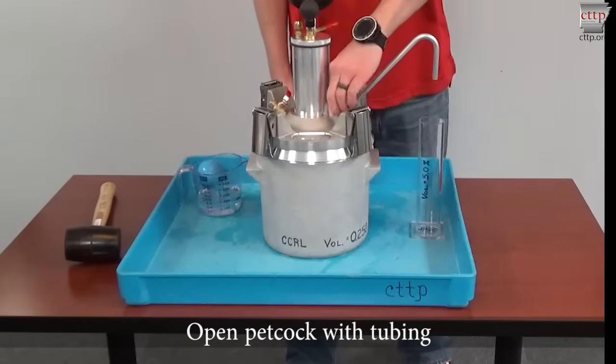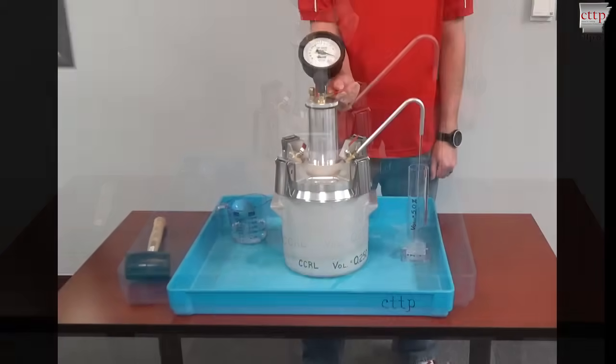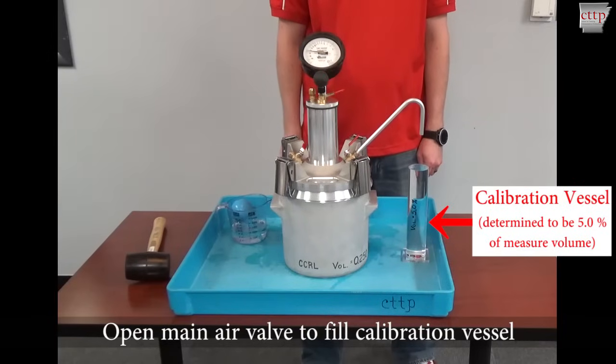Place the calibration vessel under the curved tubing to catch water. Open the petcock with the tubing. Open the main air valve by depressing the lever carefully to fill the calibration vessel. The calibration vessel is usually 5% of the bowl volume, but must be determined according to annex sections A1.2, A1.3, and A1.4.2.